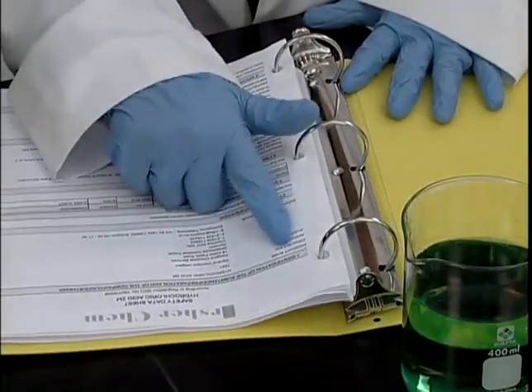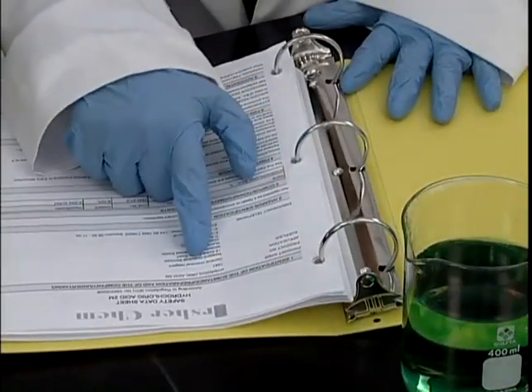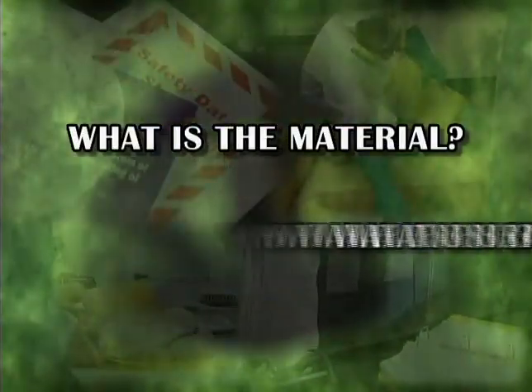Each of these questions is answered by one or more sections of the safety data sheet. For example, sections 1, 2, and 3 provide answers to the first question: what is the material and what are its hazards?